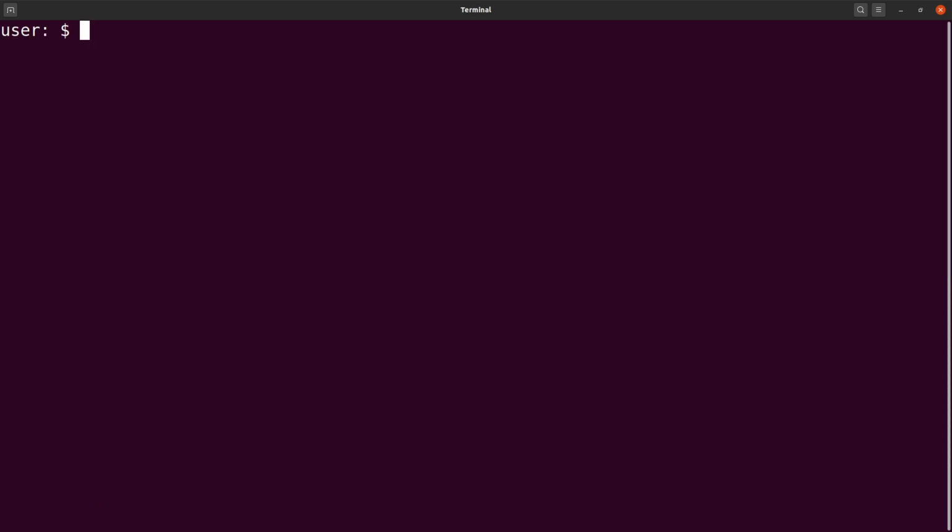Usually what we want is not duplicates, but just a list of chromosomes. This means that we have to remove duplicates from this list. So with Linux, there's a command to remove duplicates from text. That's the uniq command. Let's run the query command again, and this time we will remove duplicates. So let's go back, use the up arrow to this. With this command here, we can add a pipe and then add the uniq command. This will remove duplicates for us. So let's run this and see.